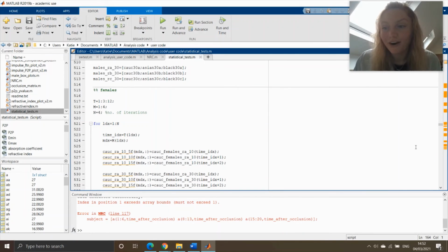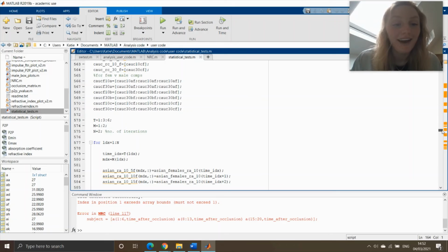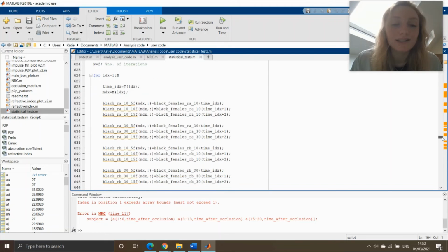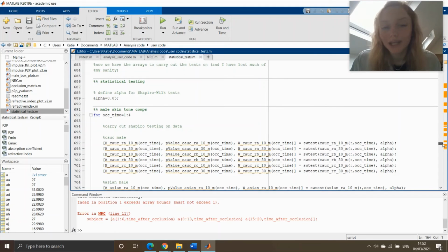I believe we cut off just looking through the data washing and just putting things into regions. This is relatively time consuming to write out, but hopefully with what I have, if you can read it, there are a few comments in there, but it's not the most well commented code. If you can adapt this to your own protocol, you can group your data as you wish, ready for comparisons, and then we get down to here.